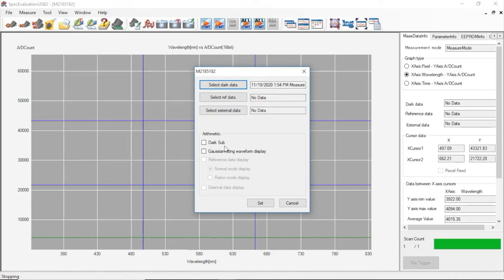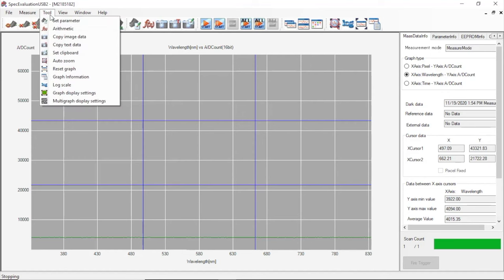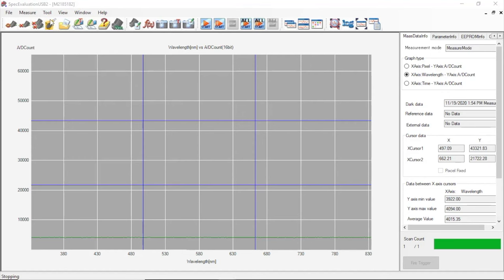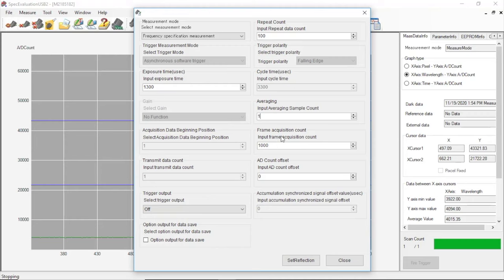This can be selected below. So now that that's set, we can take a light measurement. This time we'll set our repeat counts to 100 and we'll set our averages to 1. In the data, this will be reflected as 100 columns of scans.